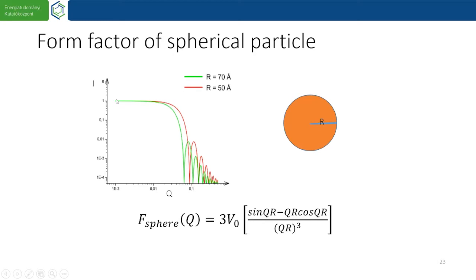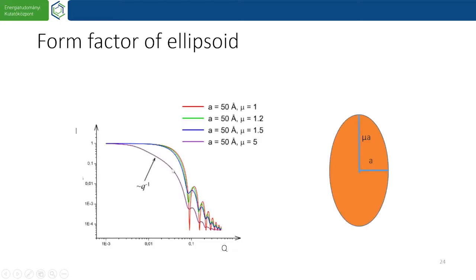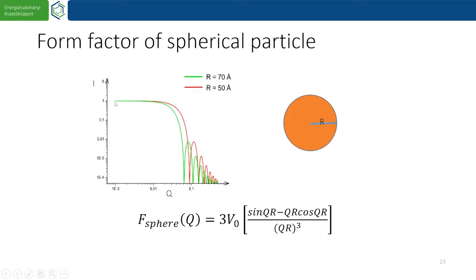And there is always a cutoff, a limit below which we cannot measure. So if this particle is too big, say 1 micrometer, then we will not see anything. Only this tail is decaying very strongly with the increasing of the Q. So this gives us approximately the picture of why we have a certain range over which we can measure different particles.